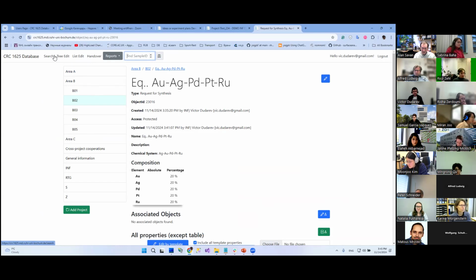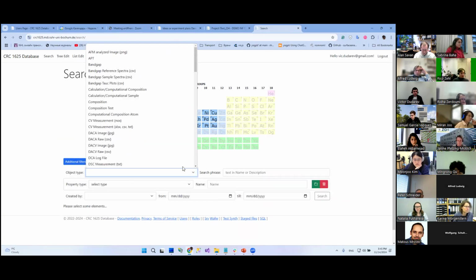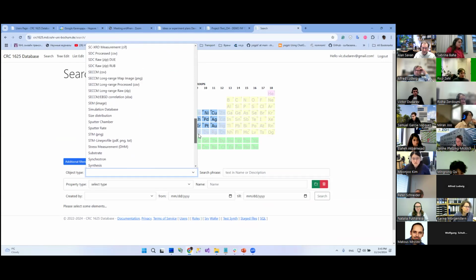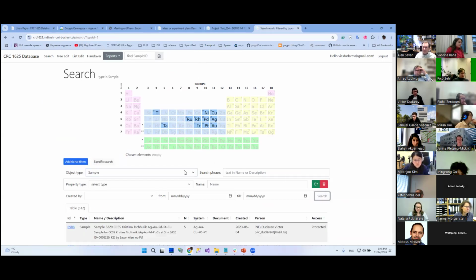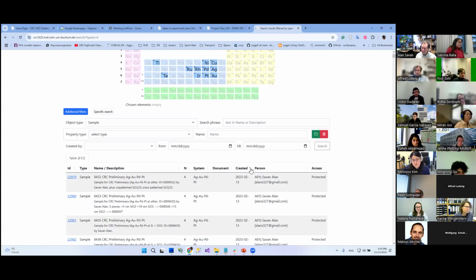Do we have some ideas? Not yet. Then in principle, I could search for something. If I search for samples, then I would get a list of 612 samples, which are in the database so far.